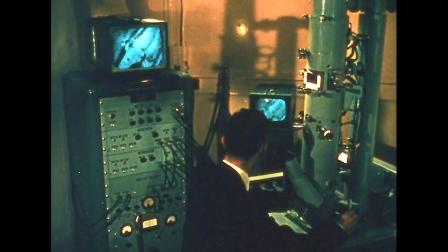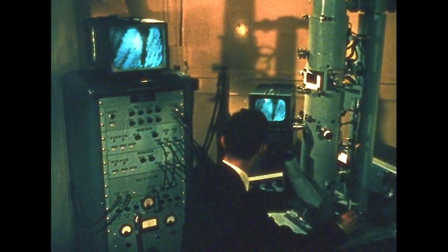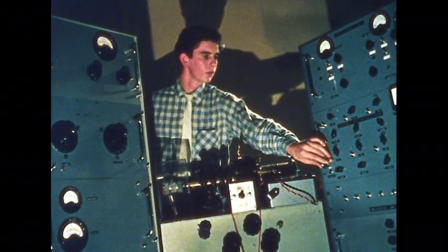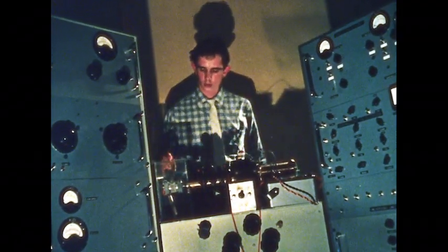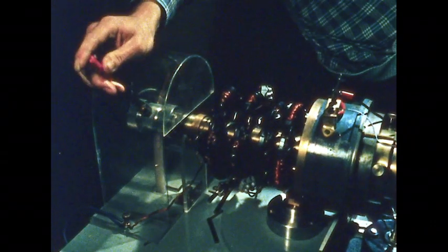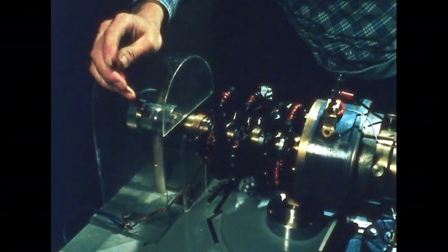Yet this microscope, which seems to bring us so near to the heart of things, is little more than 20 years old, as primitive in its own field as a 17th century instrument. But unlike Malpighi or Leeuwenhoek, the physicist understands the theoretical limitations within which he can improve lenses or step up voltages. Already, the electron microscope has shown how intricate is the detail of everything, and how much more there is to learn of the ultrastructure of our world.